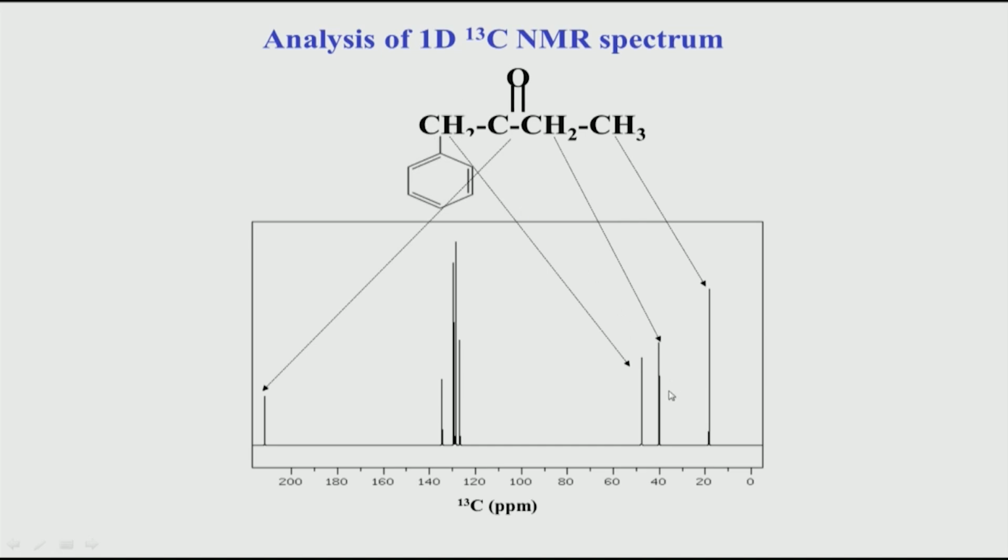So, by this kind of logic, typically you can assign the carbon chemical shifts, and we rarely record the coupled spectrum. Usually it is always the decoupled spectrum, and therefore it is just based on qualitative aspects. Of course, if you have the multiplicity idea and so on, remember we saw that we do not get multiplicity from 1D carbon.